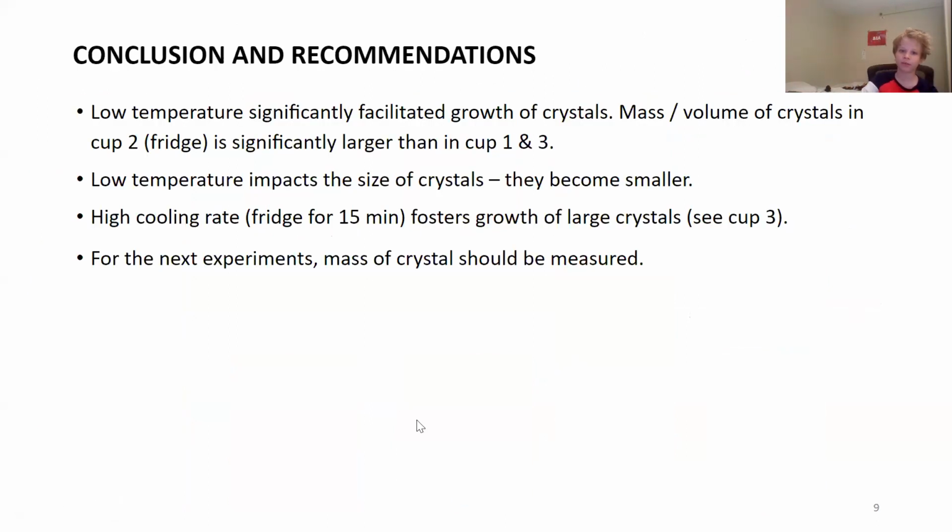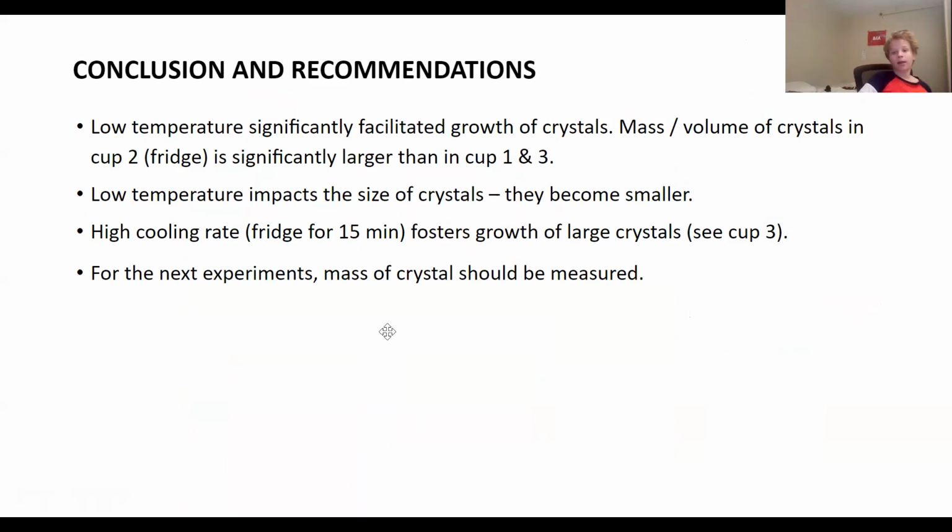Our conclusion and recommendations are that low temperature significantly facilitated the growth of crystals, and that mass and volume of crystals in cup 2, the fridge, is significantly larger than in cup 1 and 3. And that low temperature impacts the size of crystals because they become smaller. And that a high cooling rate in the fridge for 15 minutes fosters growth of large crystals.